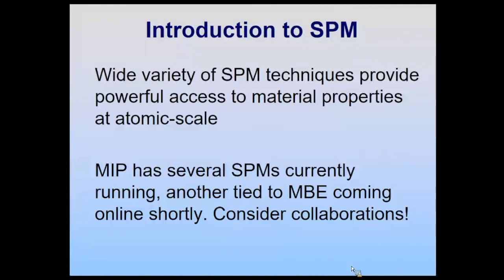Okay. So is it at all possible to measure the density of states with the conducting AFM tip? Absolutely. You can do conducting tip AFM, in which case you're basically doing STM. You can go into topography with the feedback using the tunneling current and just do STM. It never works as well as a real STM. The cantilever tips tend to not be as sharp, and the cantilever is shaking, so you tend not to get the resolution that you do in an STM. But if you're willing to sacrifice a little resolution, you absolutely can do STM with an AFM.